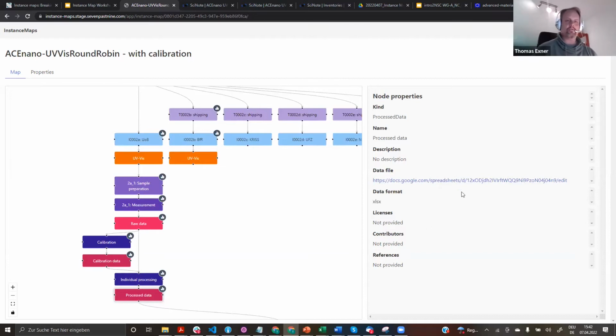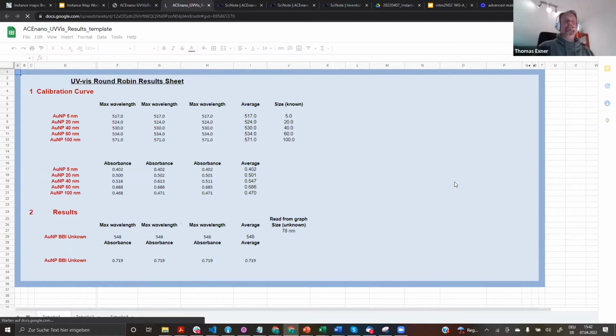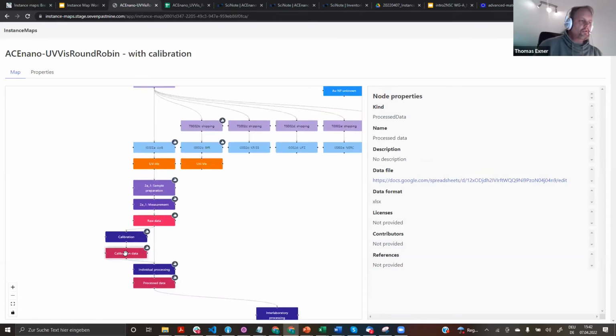If you think that this is better, then just build that in a Google Sheet, and you have the things, and you can directly link in whatever you have. At one point of time, even the curve appears. Good. Okay. Now I cannot show that.